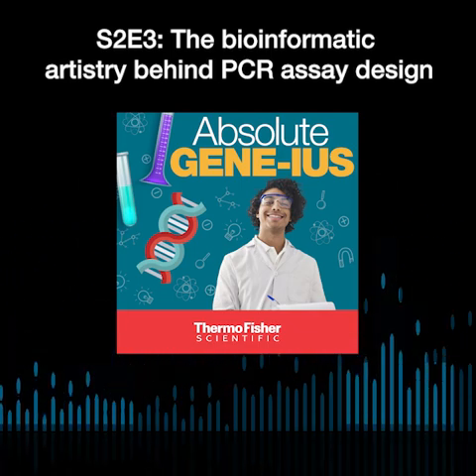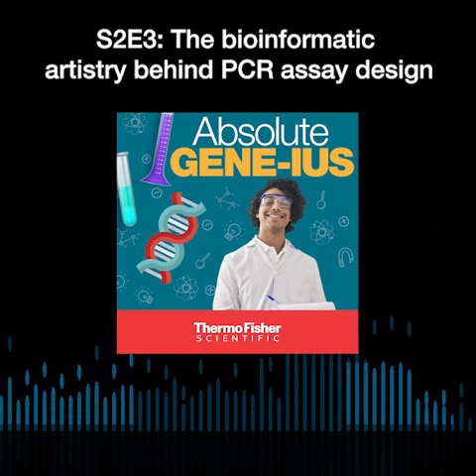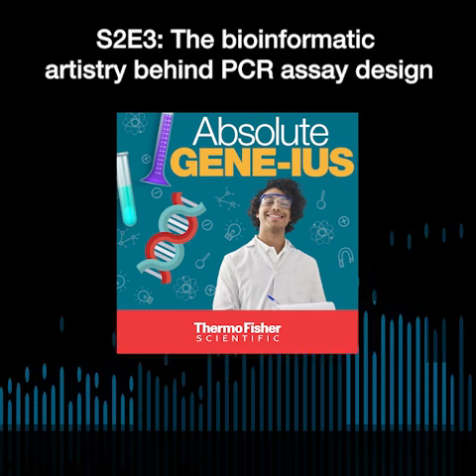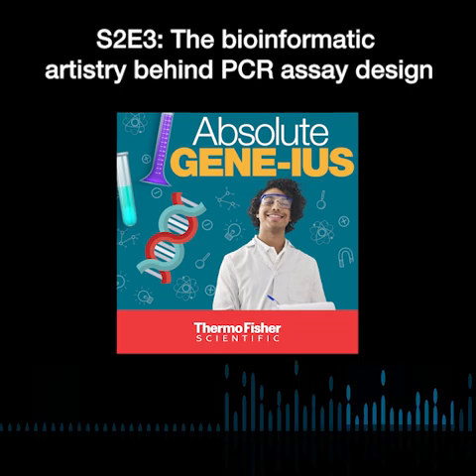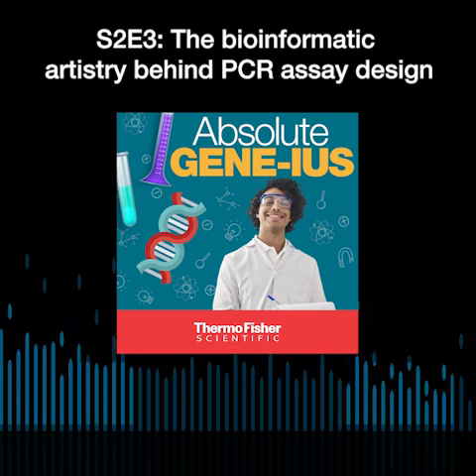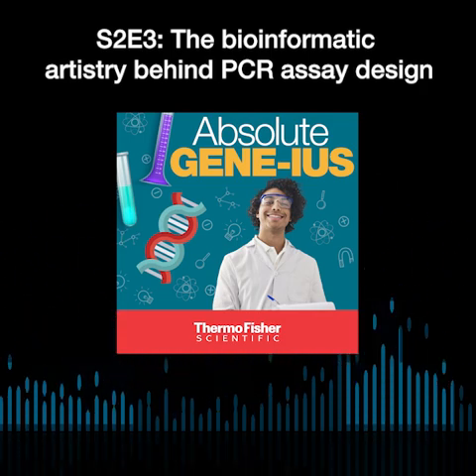We would like it sort of 90 degrees for both the dyes. When they start coming closer and start making a wedge kind of shape, it makes it hard for us to cluster and distinguish one population from another. That's when we start troubleshooting. Yeah, and then also specifically with SNPs or mutations, sometimes you can get the probes, like I had a case recently where my wild type probe was binding to both the mutant template and the wild type template. So that's another case that was very obvious that we needed some troubleshooting.